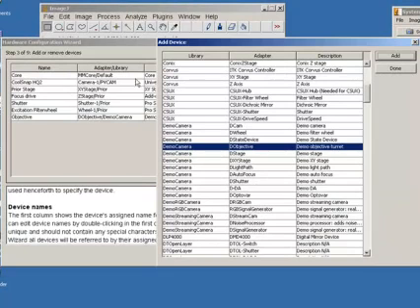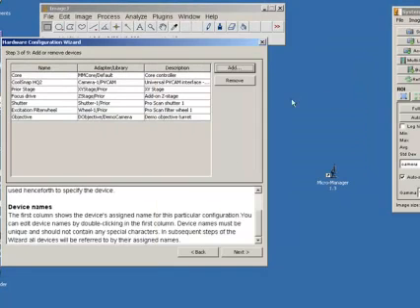So, we've got all the various different components added in now. So, let's click done. And we can start working our way through the menus here.